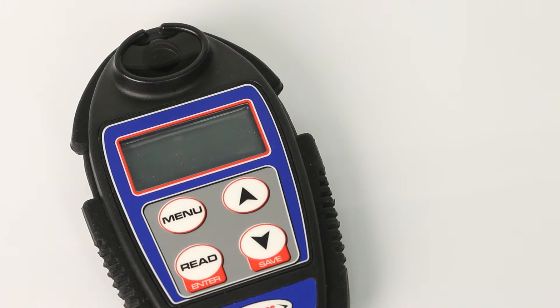Press Read Enter again to measure the conductivity of the sample. The display shows dashes while reading. Once the reading has stabilized, use this reading.